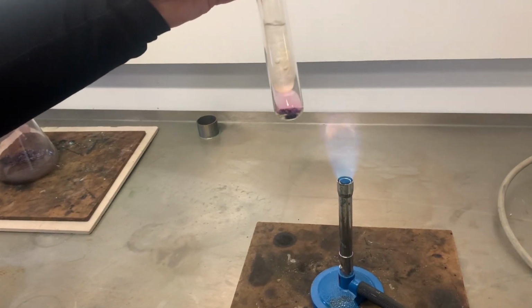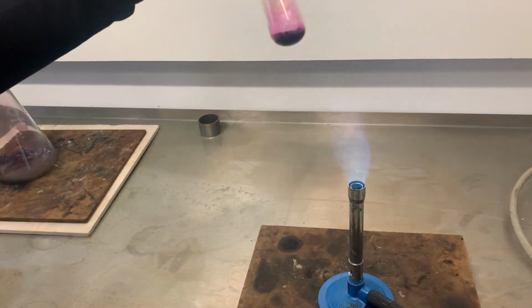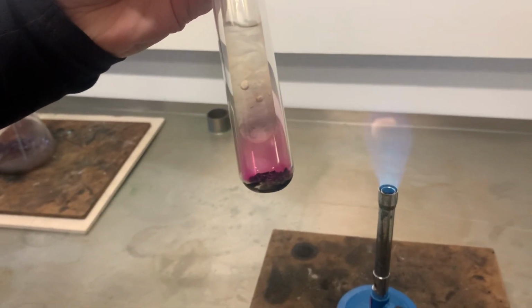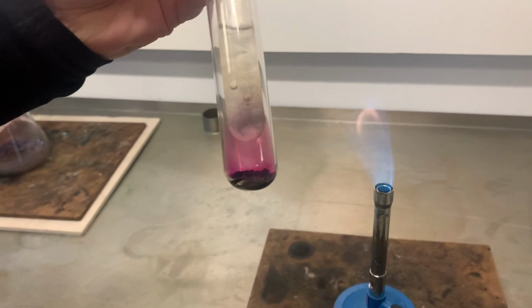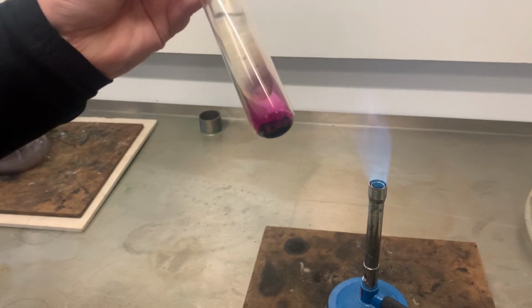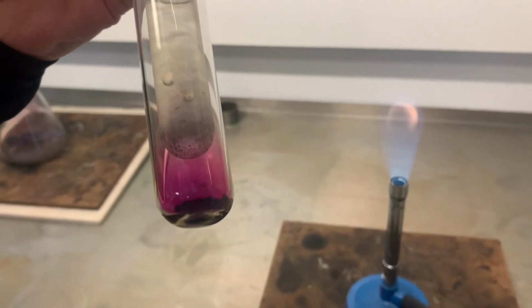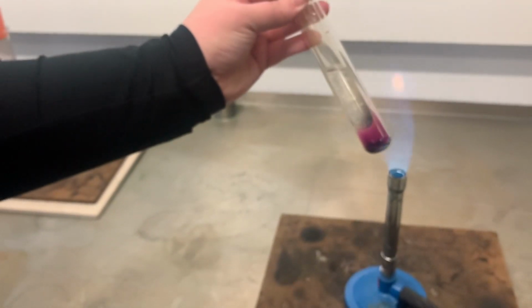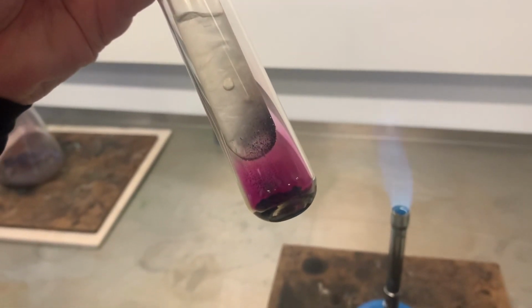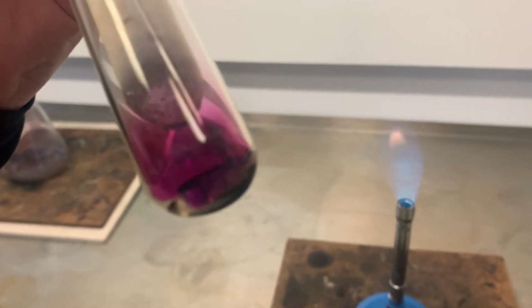So gently heating it, we've got the purple vapour. The purple vapour is rising up, it's hitting the surface of the test tube. Start to see some lovely crystals forming. I'm not sure if the camera's picking it up, but there's some really nice crystals forming on the surface of the test tube. Hopefully you can make it out.